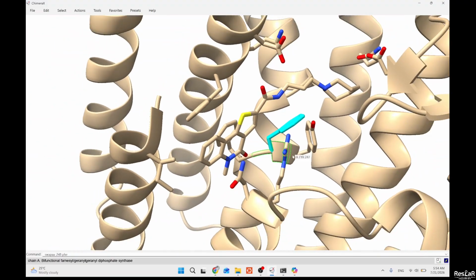If you're using PyMol, or whatever tool is available to you, there are very many ways of mutating your structure. But this is just a very simple way. ChimeraX, I've used it, and then you can also use a lot of other tools.